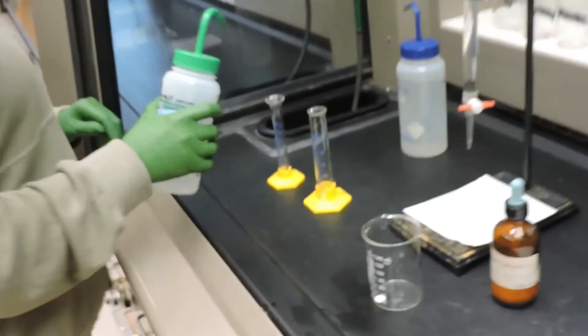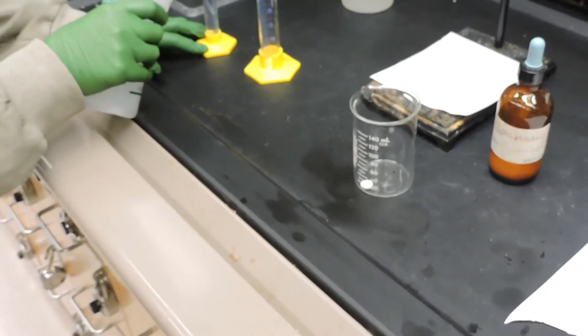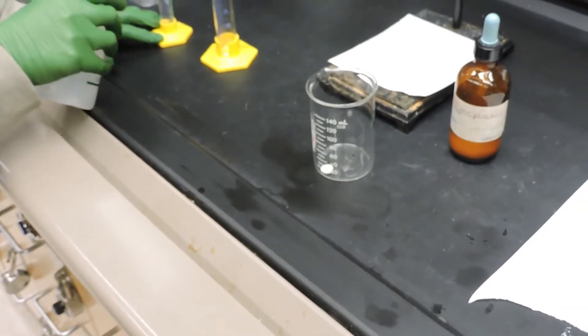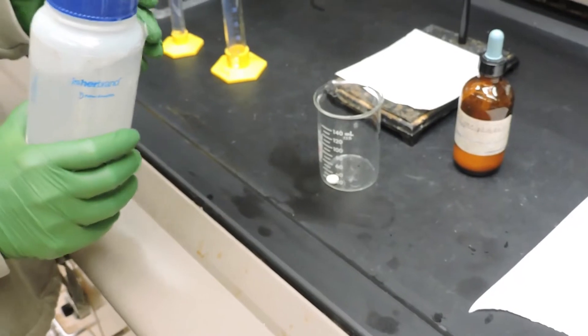In order to titrate the commercially produced aspirin, we put one tablet into a beaker. To this tablet, we'll add three drops of water and let the tablet absorb the water so we can crush it into a powder with a stirring rod.